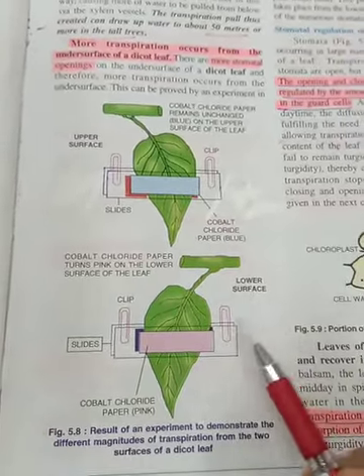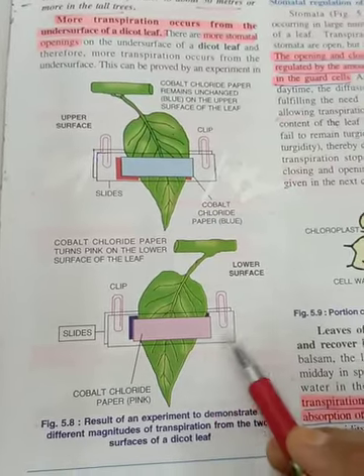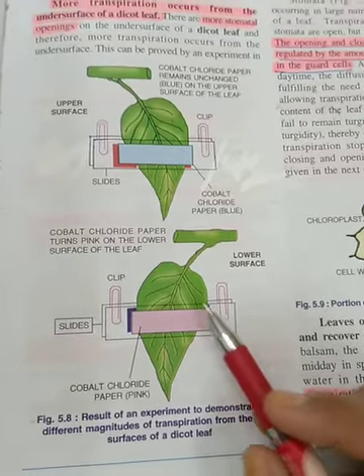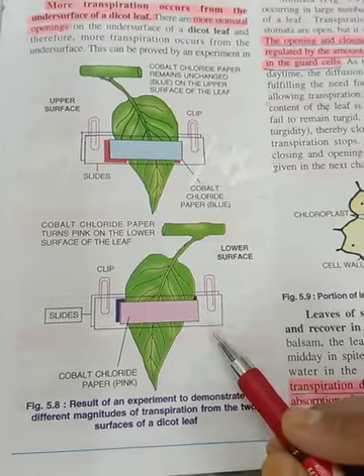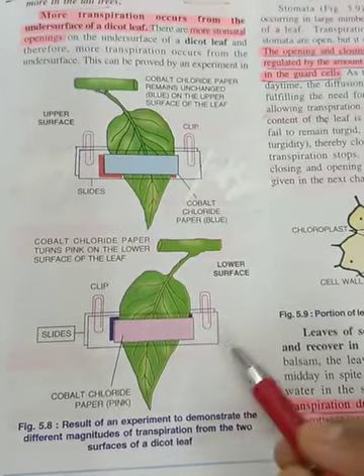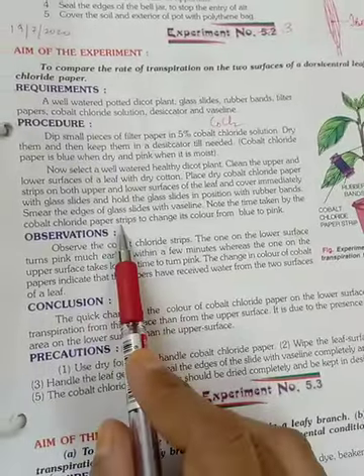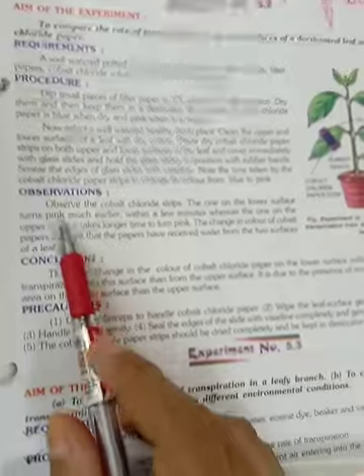But the lower surface, or what you call the dorsal surface here, will change into a bright pink color in a very short time, proving that there are more stomata and therefore a higher rate of transpiration. So this time period we will note: the time taken by the cobalt chloride paper strips to change color from blue to pink. Observations.